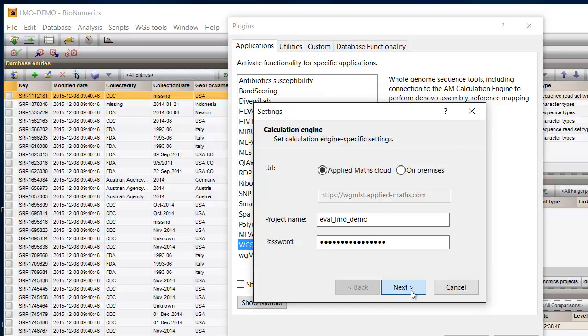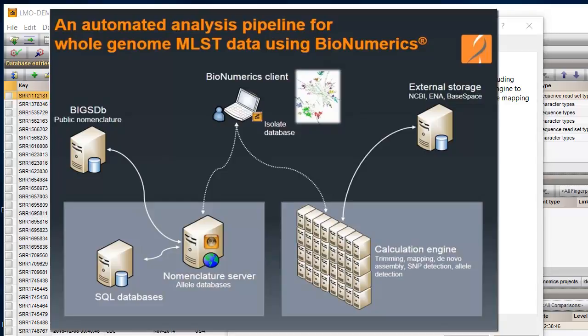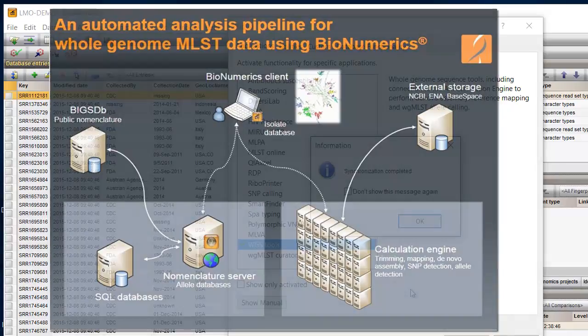In a curated whole genome MLST reference allele database, the organism-specific typing schemes are defined and need to be synchronized to the sample database upon installation.